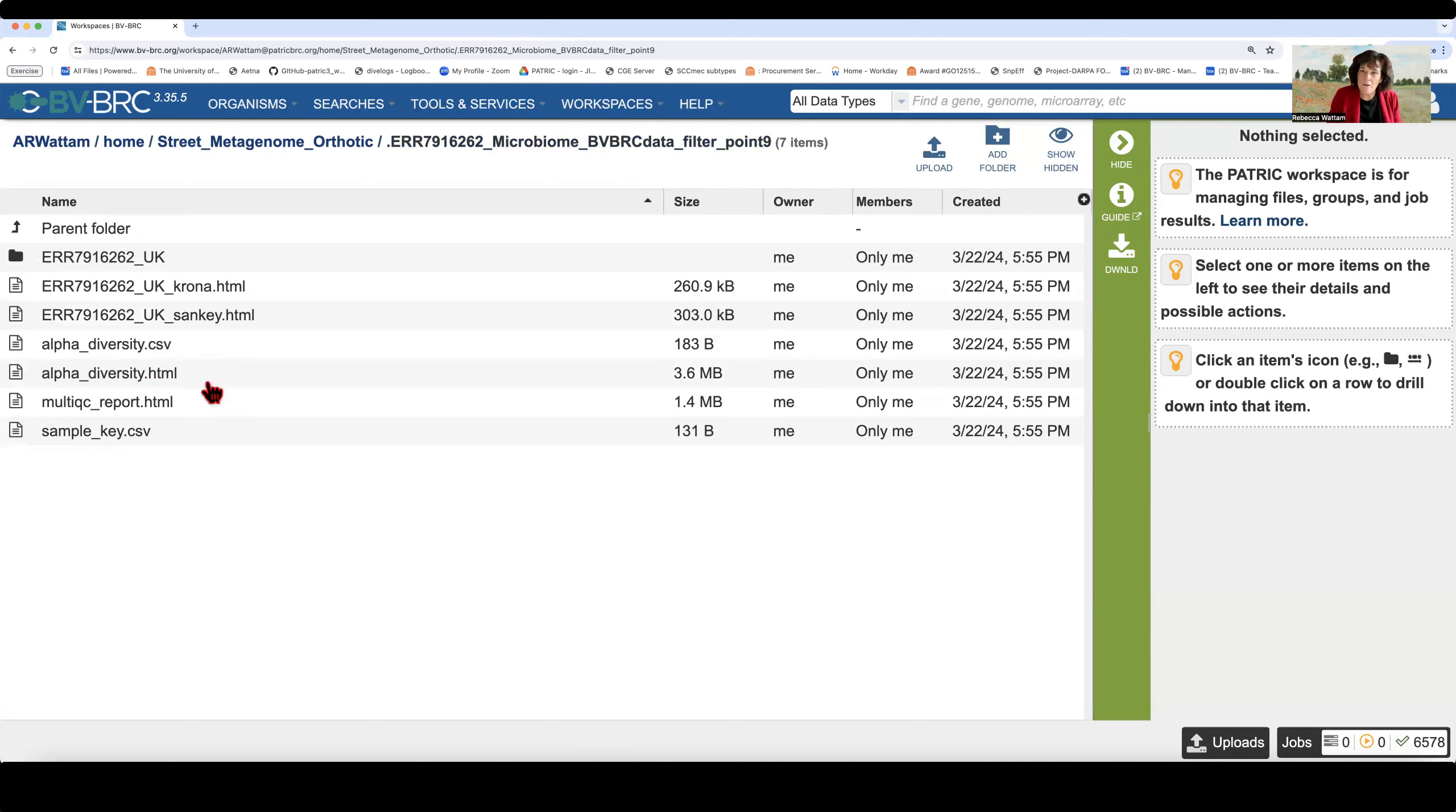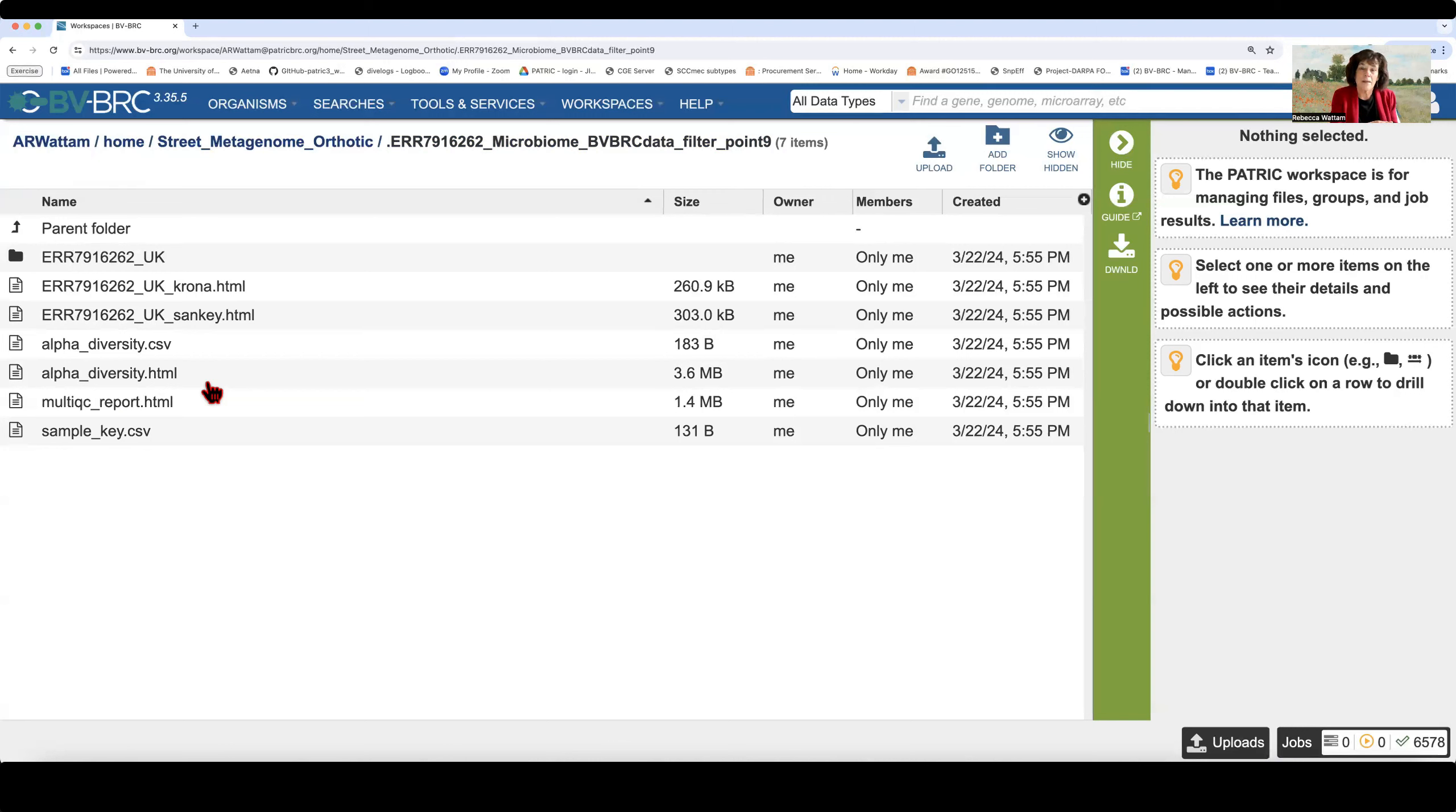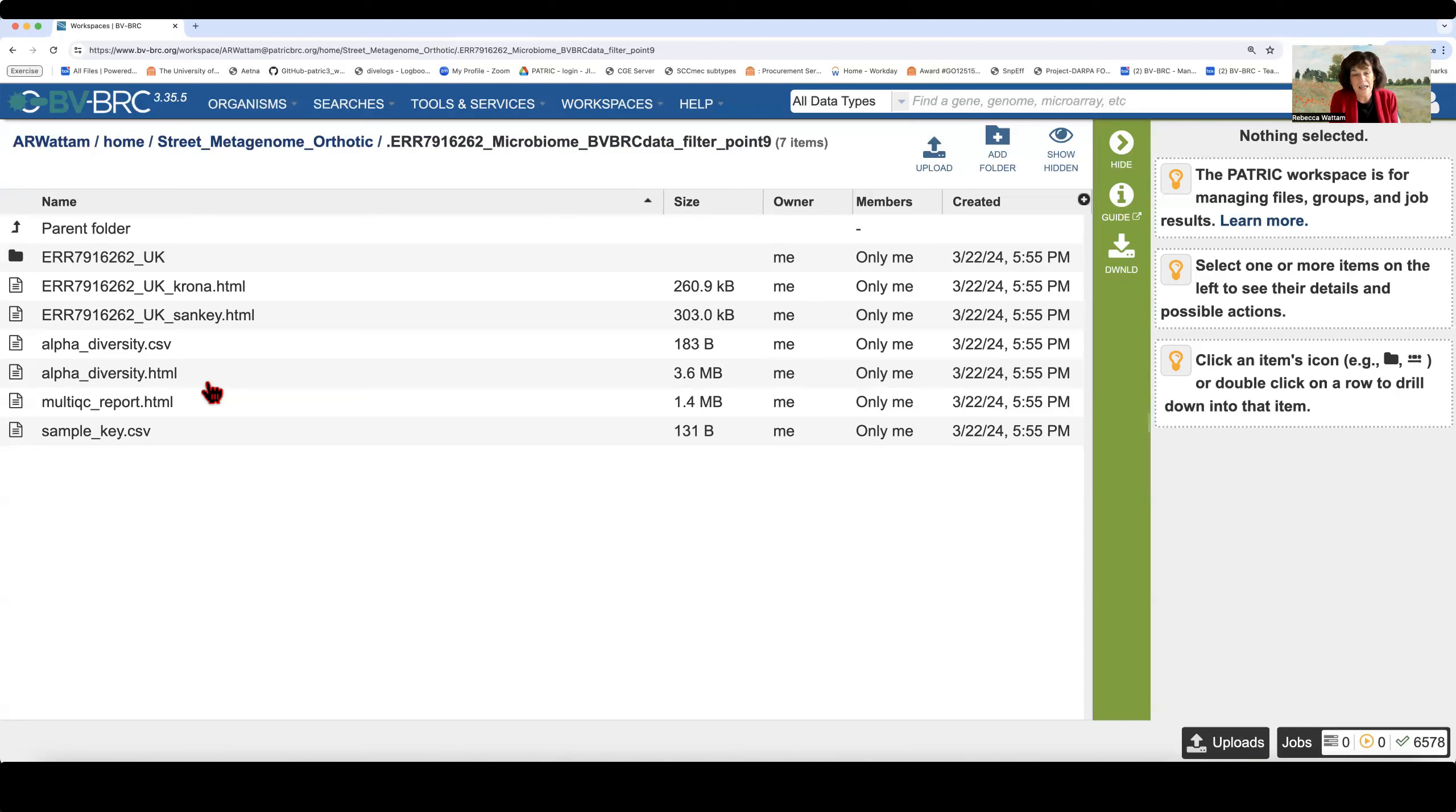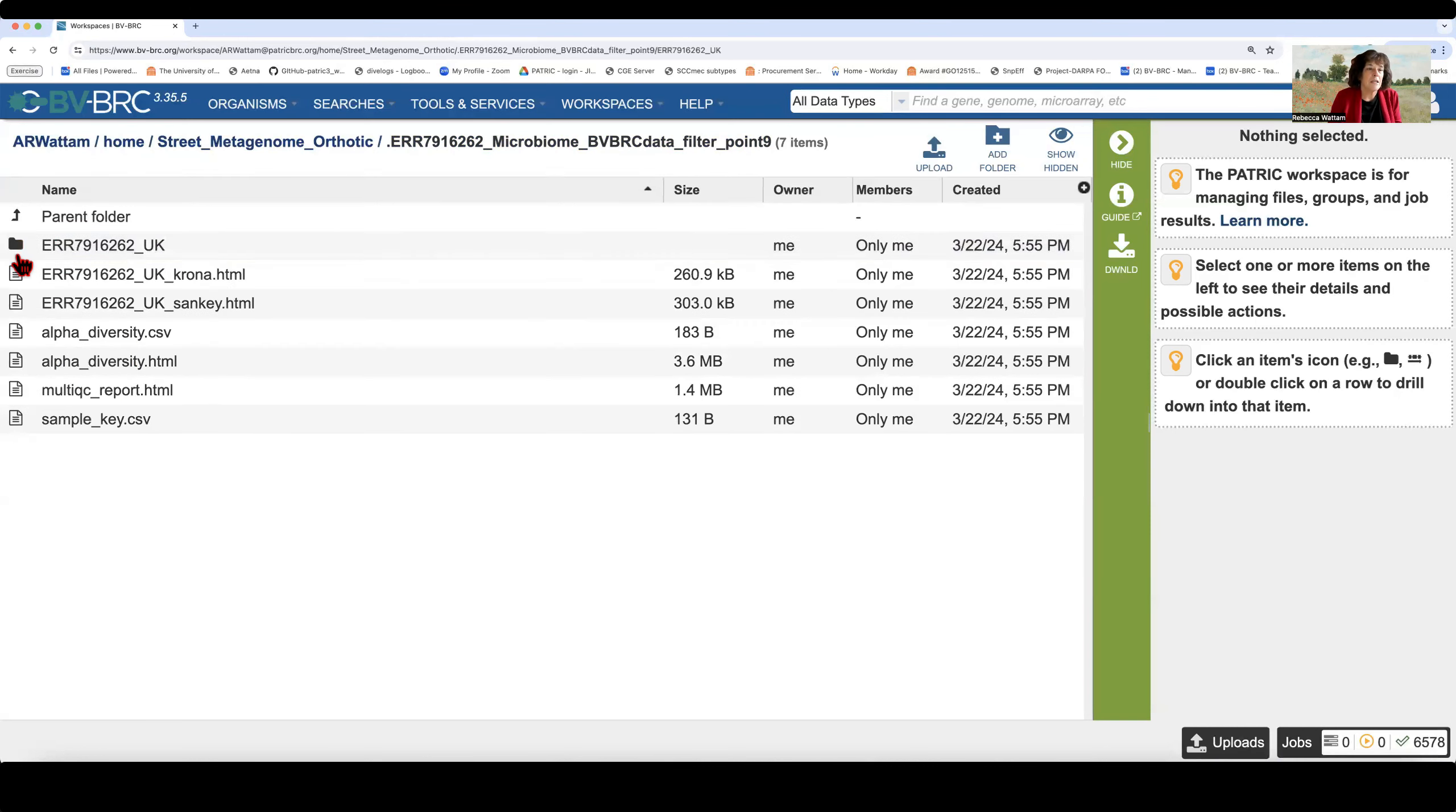These are the diversity statistics across the entire job. And what do I mean by that? If I had submitted more than one sample, if I'd submitted as many read files as I wanted to, this would compare the diversity across all of those. It's really valuable. And I'm going to show it to you in a later video what that looks like.